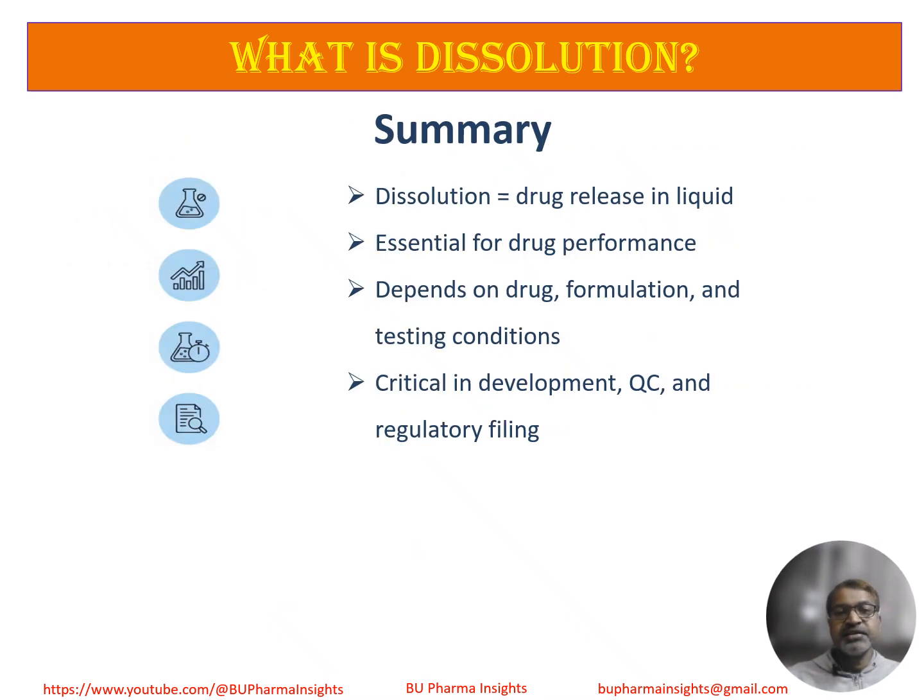Now I'm summarizing this presentation here. Dissolution tells us how quickly and how much drug is released from a dosage form. It is influenced by drug properties, formulation factors, and testing conditions. It is essential for product development, quality control, and regulatory approvals. Understanding dissolution is the first step toward mastering pharmaceutical testing.